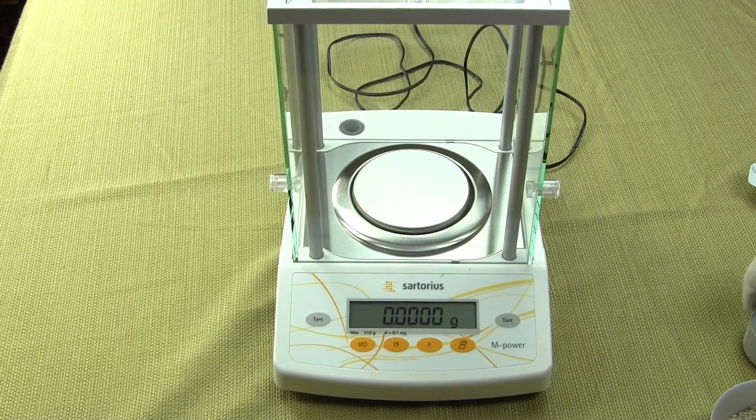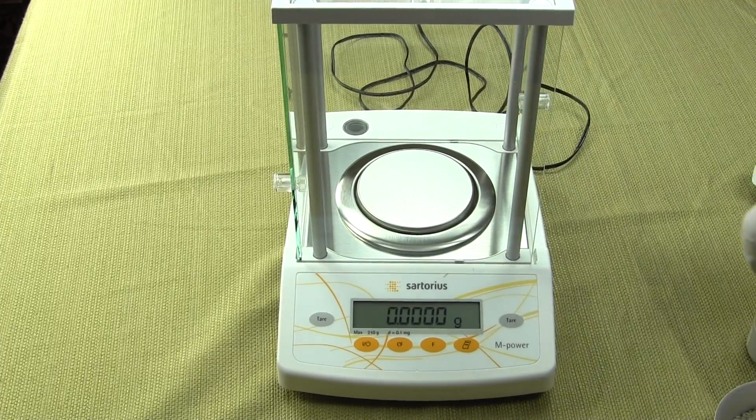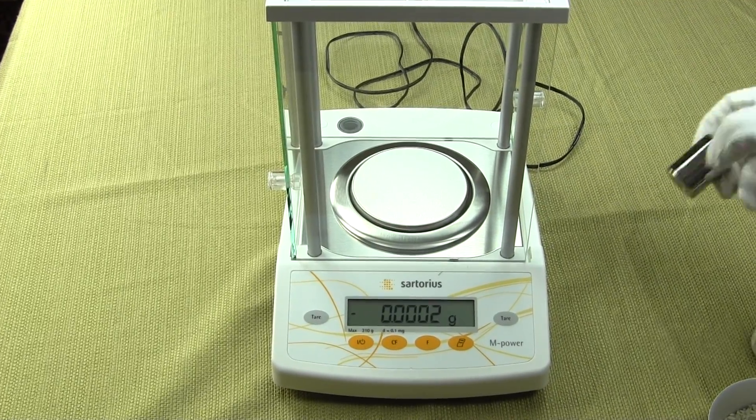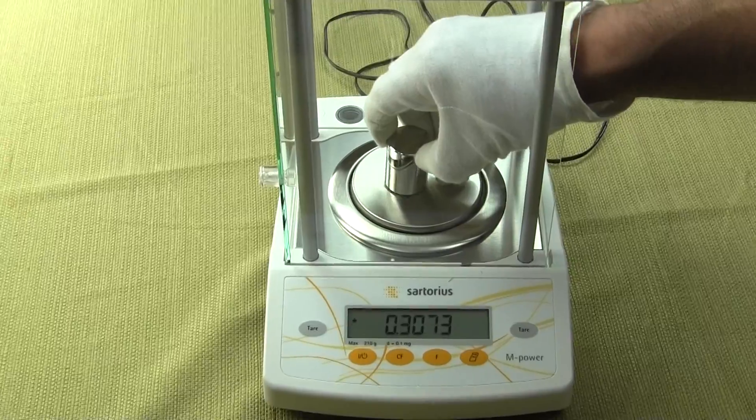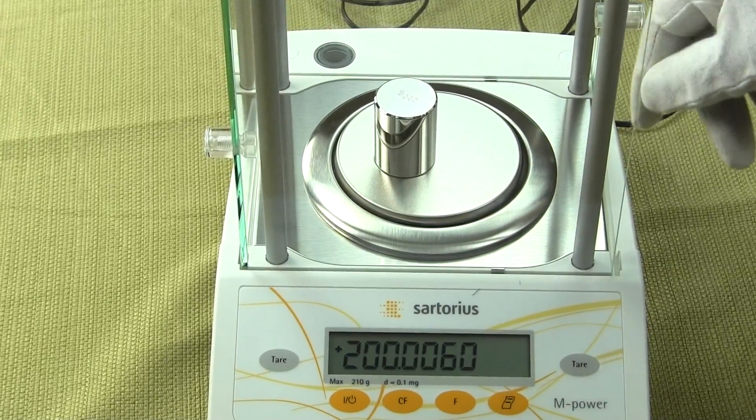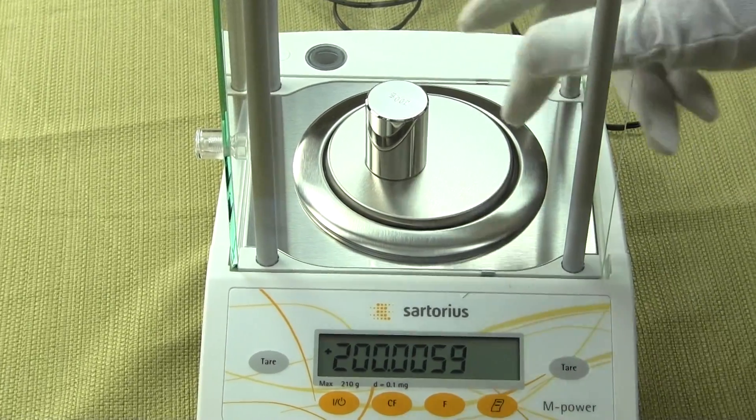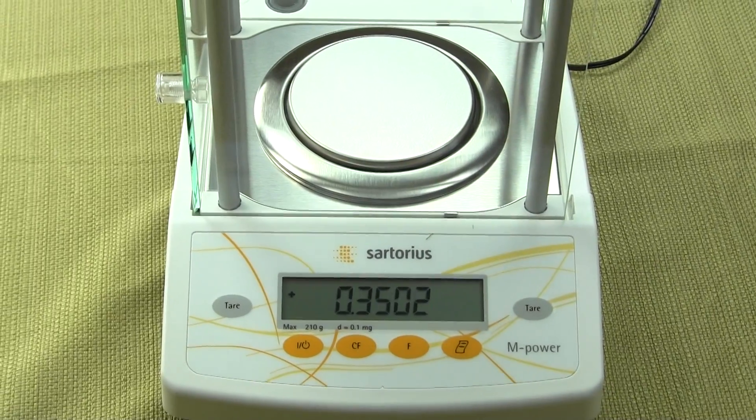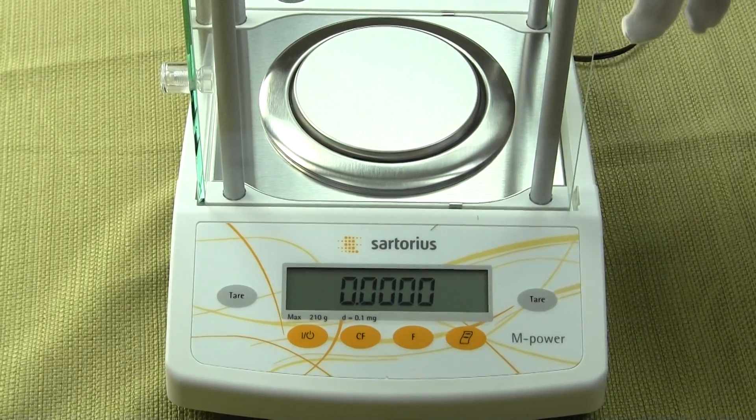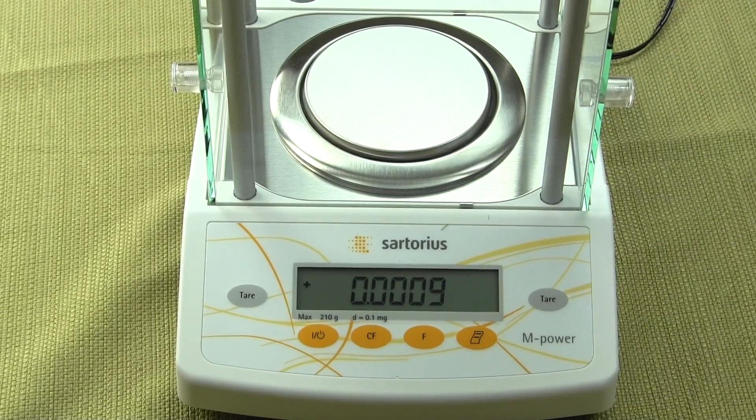And again, balance is extremely easy to operate. Nice response time, small platform. Calibration is very simple to do. So very easy to use in your laboratory. We sell a lot of these to the schools and also to laboratories.